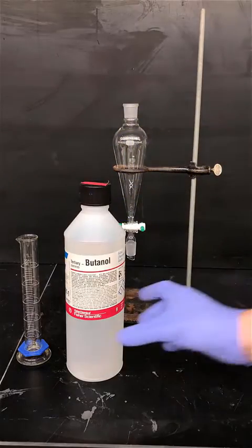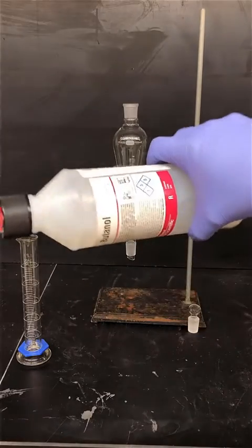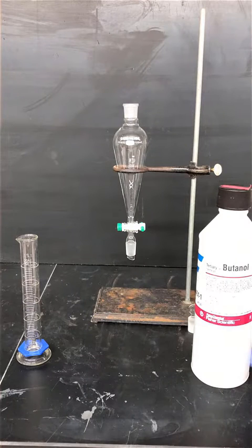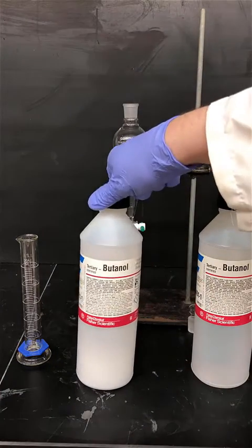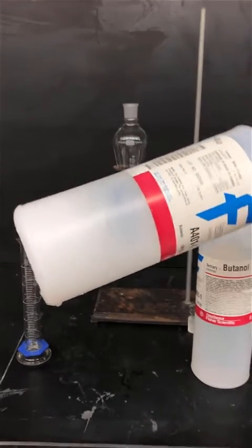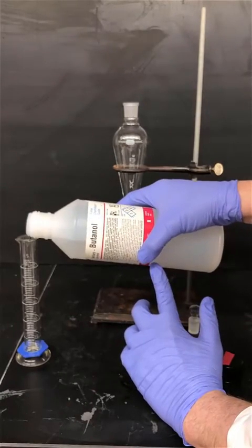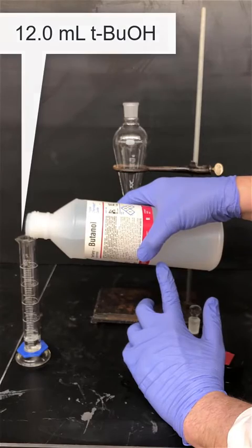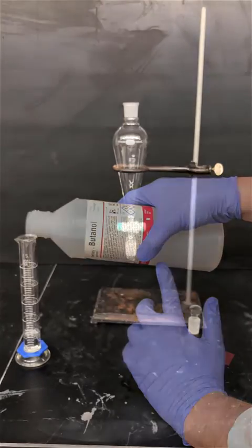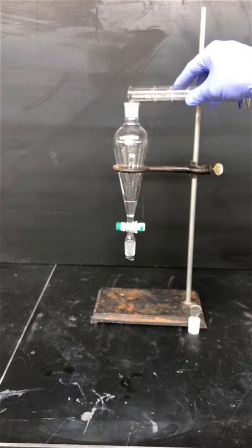Next we'll add the first reagent: tert-butyl alcohol. Tert-butyl alcohol has a melting point that's very close to room temperature, so in a warm room it'll be a liquid, but in a cold room it could be a solid. If your bottle is crystallized because it's been in a refrigerator, you should warm it up in a warm water bath to make it a liquid — that'll make it easier to pour and measure. Pour 12.0 milliliters into your graduated cylinder, then check that the stopcock is in the off position and pour the tert-butyl alcohol into the separatory funnel.